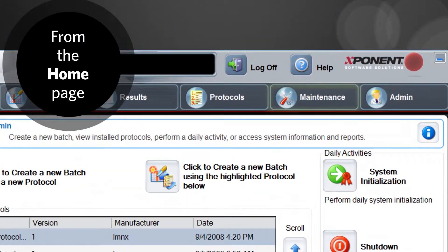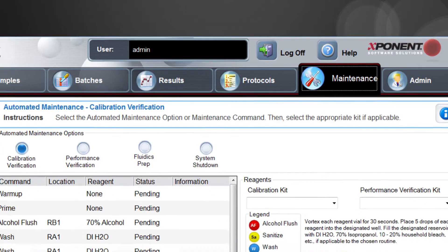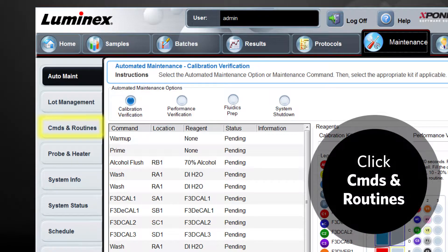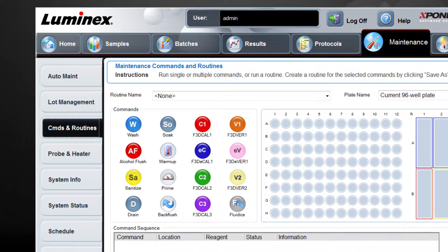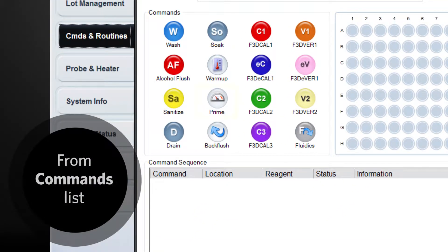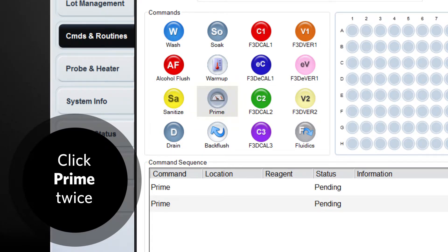From the home page, click the maintenance tab. On the maintenance tab, click Commands and Routines. From the commands list, click on Prime twice to add it to the command sequence.